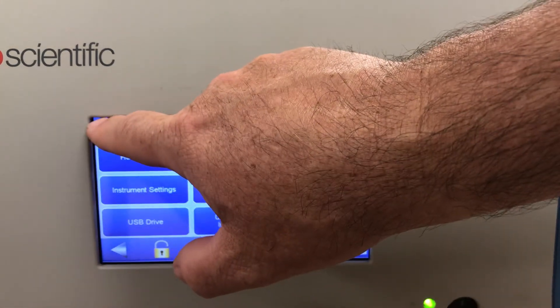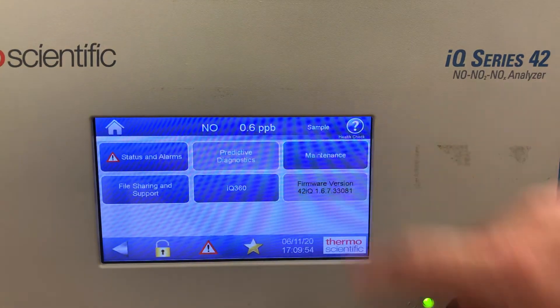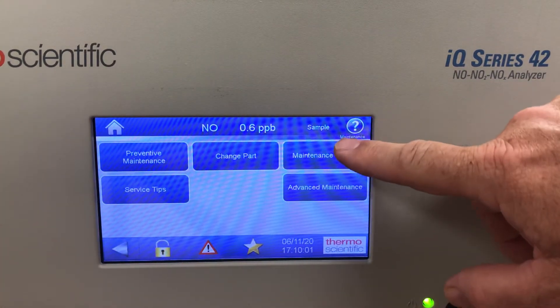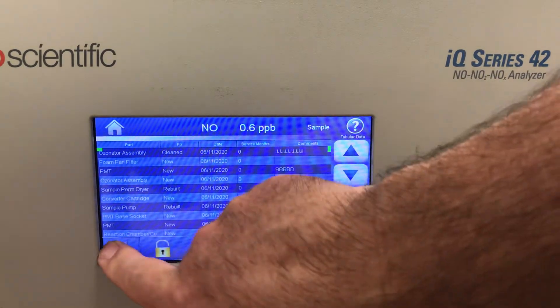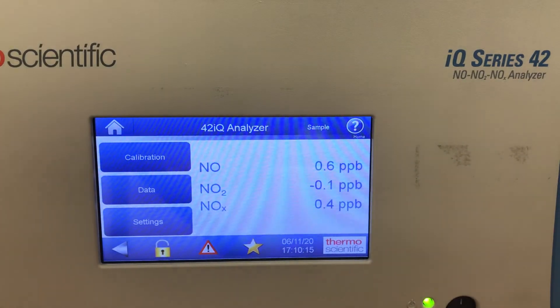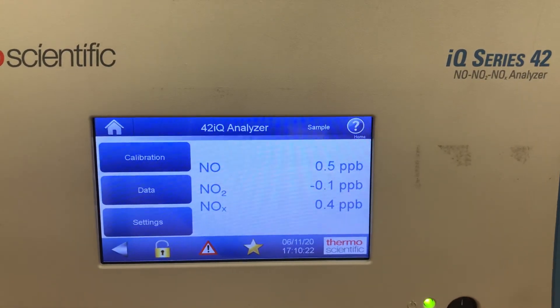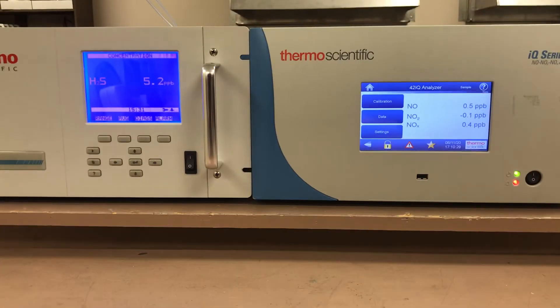Going through these menus shows how much information you can get from the IQ-Series and how to do preventive maintenance — using the maintenance screen, the preventive maintenance menu — with lots of information to help the operator understand what maintenance was done, the service intervals, when parts were changed, when the pump failed, and service tips. Compared to the I-Series, there's a lot more information available to the operator. If you have any questions, feel free to comment. Thank you.